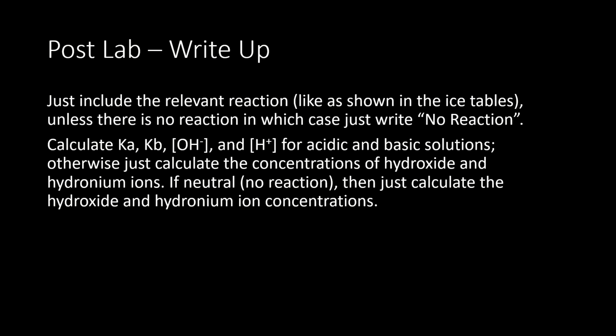So as a wrap-up, for your post-lab, just include the relevant reaction. That is, the reaction that's interacting with water. You do not need to include your dissociation reaction of your salt. Just if there's an ion from that salt that reacts with water, include just that pathway. And if it's something like potassium aluminum sulfate, well, if you saw your pH was acidic, use the aluminum pathway only. If you saw that your pH was actually basic, then write the sulfate chemical reaction pathway only. If there is no ion that has an interaction with water, then on your post-lab, for that salt, just put no reaction.